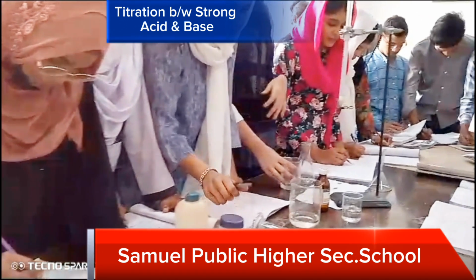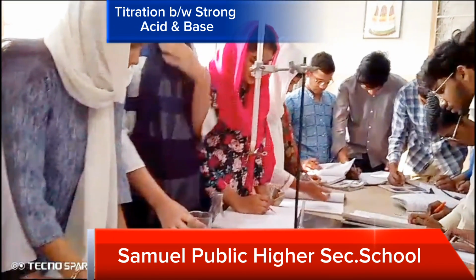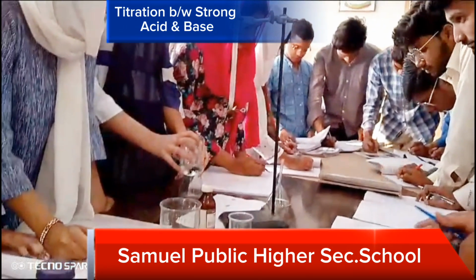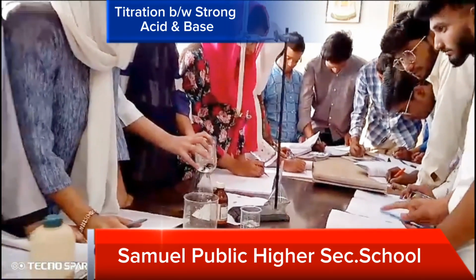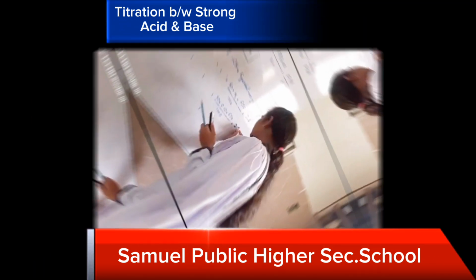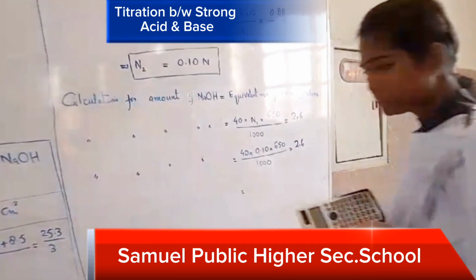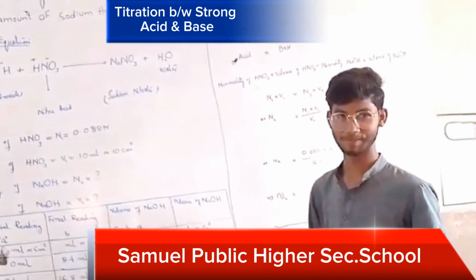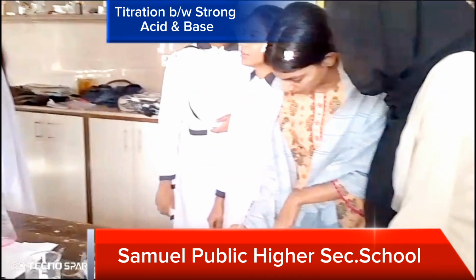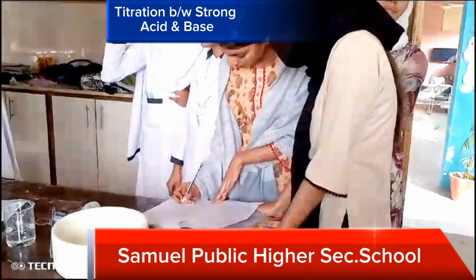But when the given compound consists of a strong acid and weak base, or a strong base and weak acid, the base must always be used in the conical flask, but the acid is always used in the burette.